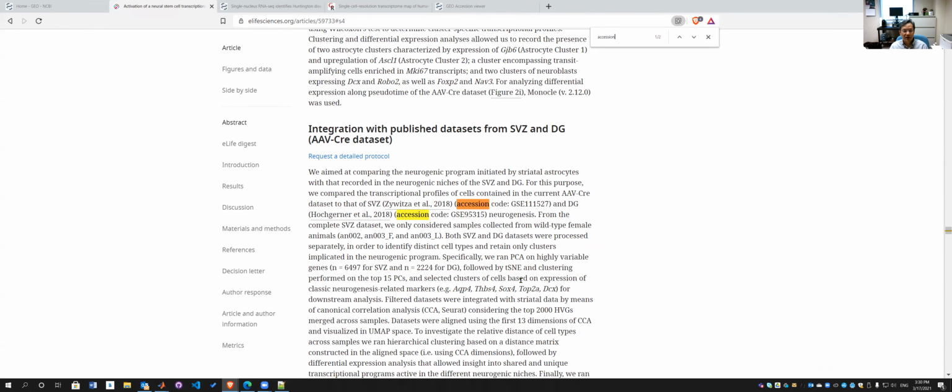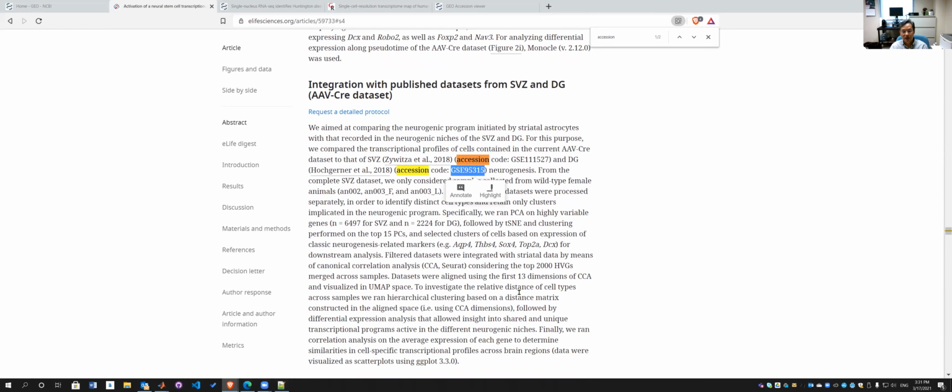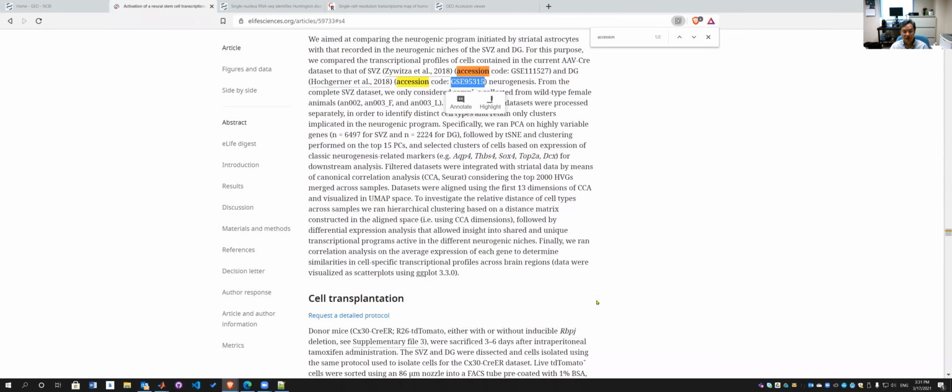Yeah, so we have some accession numbers, but we have to look into each record more carefully before we download anything. Okay.